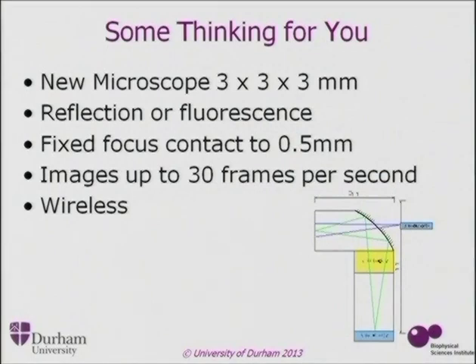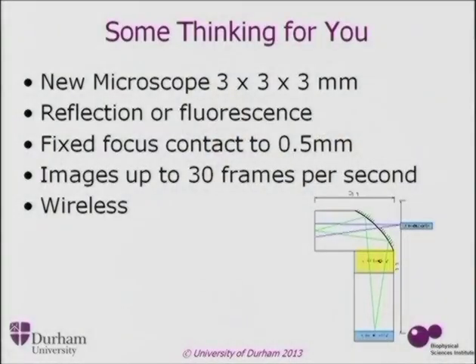And you can now buy commercial cameras, it's just the chip that is 2 millimeters or 1 millimeter square with 756 by 756 pixels. And you can take that down at the bottom and put all this in a small package. You do need an external battery. We don't have a battery.